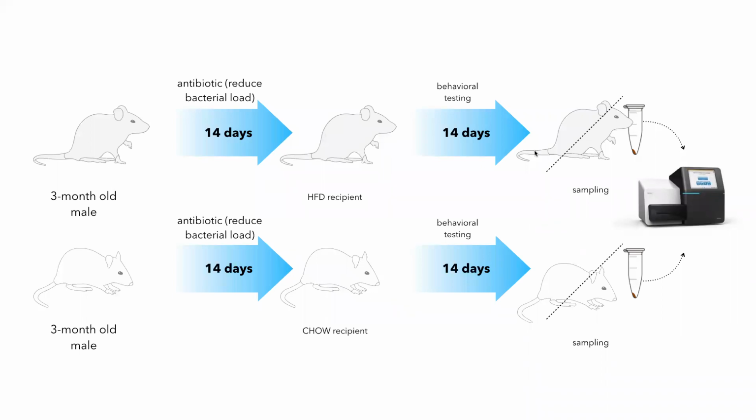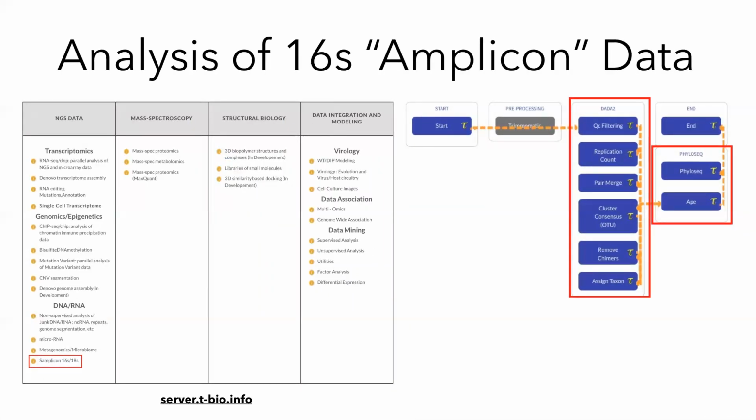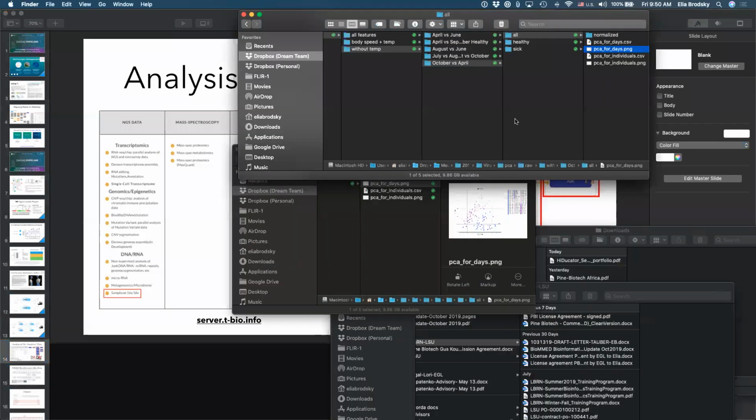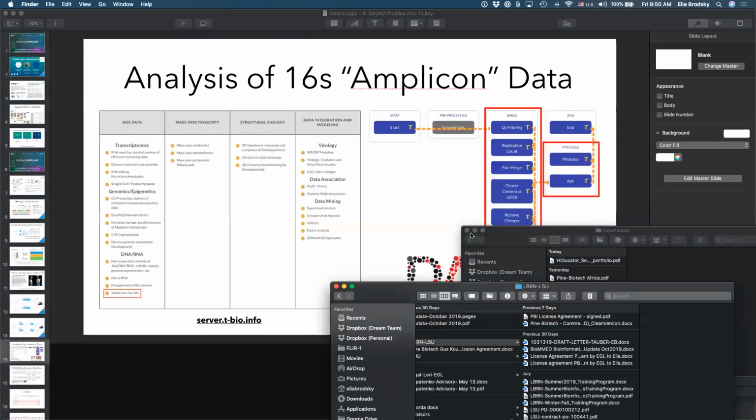So ultimately, for us to understand what changed at the level of microbiome, we need to analyze the sequencing data. When we need to see how the microbiome affected their behavior or their psychological condition, we can do behavioral testing. But also, there were some samples taken after the fact, right? So now let's talk about the analysis itself. Before we jump into the pipeline itself, let's take a look at the data that was provided to you. So we can go to the data.